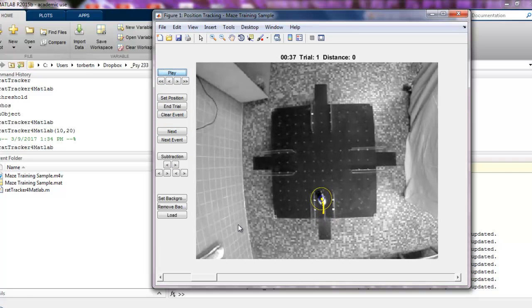And so this will just keep tracking until it reaches the end of a trial. What I generally like to do is go through a video, mark the beginning of each trial and mark its end. If you have your notes from the session, you'll know about when this trial ends, but you can also just find it by moving forward a little bit.